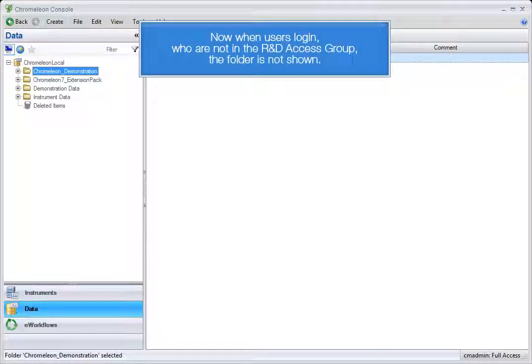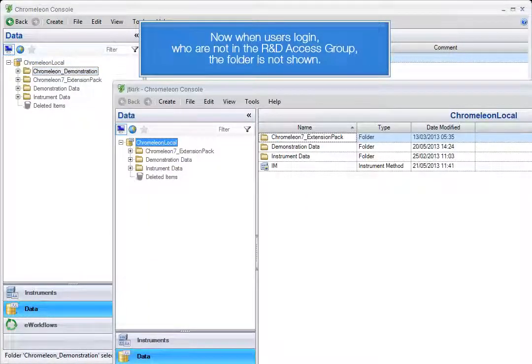Now when users log in who are not in the R&D access group, the folder is not shown.